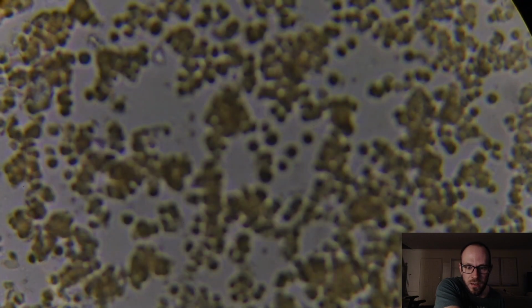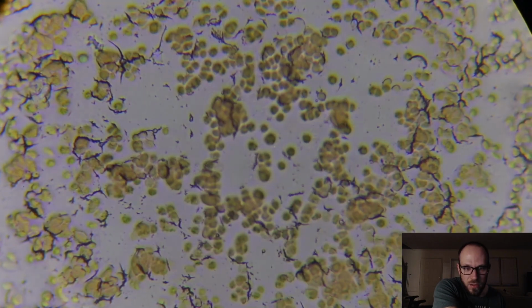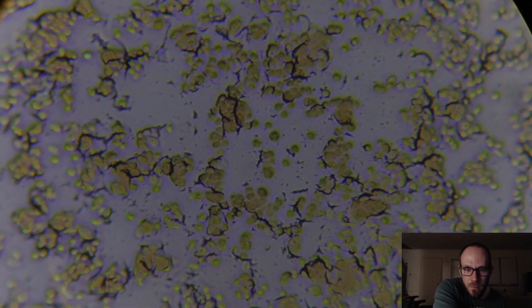Let's look at me at 400x. This is what kept me alive. You can see the essence of me right there. I don't know why we're seeing green fringing. I don't know what that's about. Could be your veins full of coral.